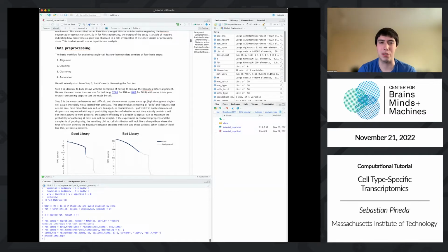The mtRNA should be sequestered to the mitochondria, but it's in my sample. That means that the cell's probably lysed. It's not really a good cell to profile. The truth is that if you're studying Huntington's, if you're studying ALS, that is actually a disease phenotype, mitochondrial RNA release. It then binds to the ribosomes that are attached to the nucleus, which you pull down. So, it's not that simple.